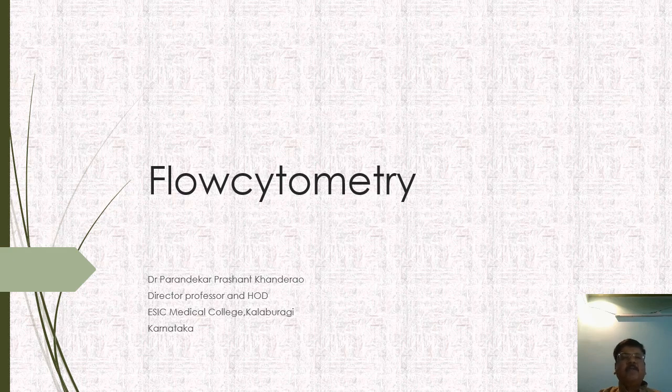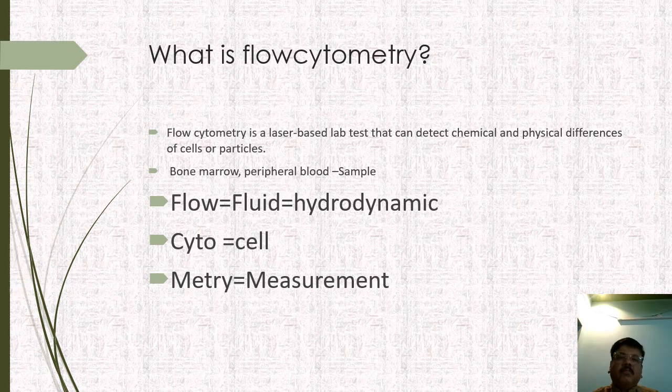Today's topic is flow cytometry. So what is flow cytometry? Flow cytometry is made up of three words.